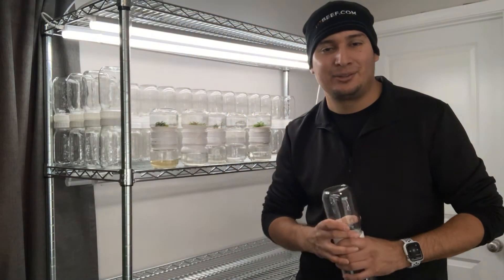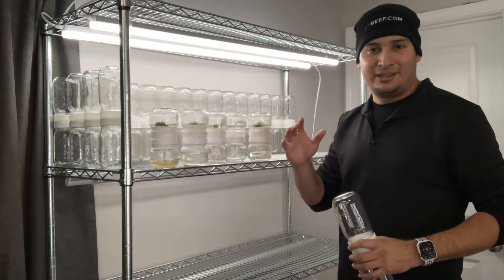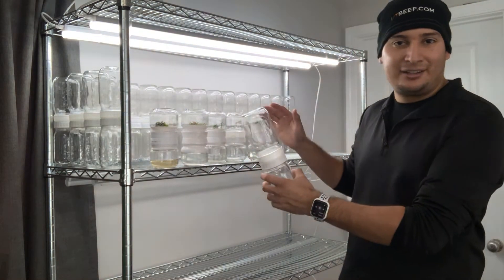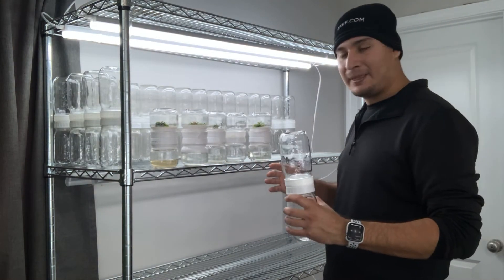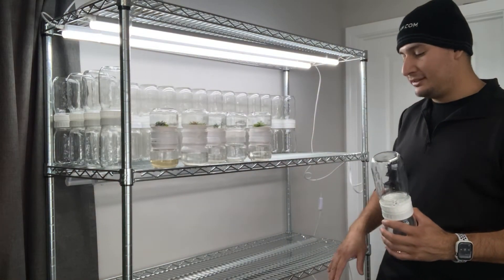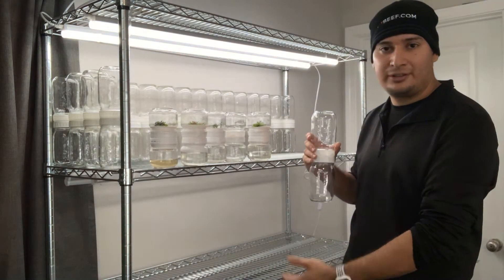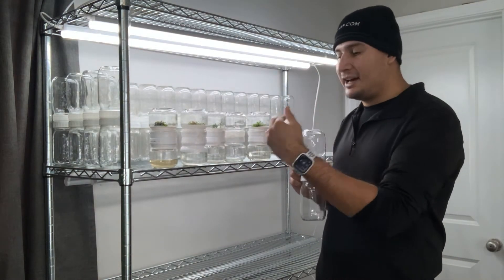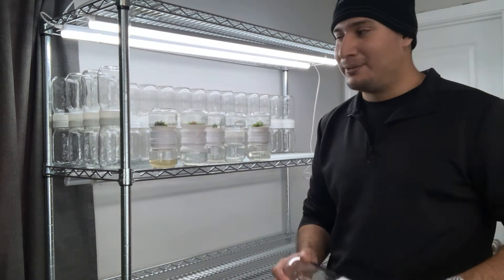Welcome back! Today I want to show you something I'm very excited about: I'm building a whole system of biocouplers. I have a standard 18 by 48 inch metal shelving unit, and on each shelf I can fit 75 biocouplers. With the configuration I have right now, I can fit 300 biocouplers total, and I could add one more shelf to get 375 — but 300 is way more than enough.